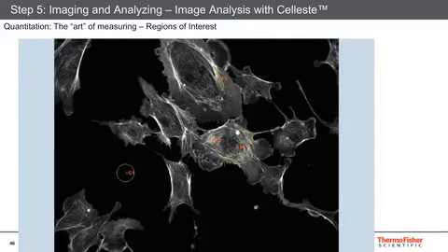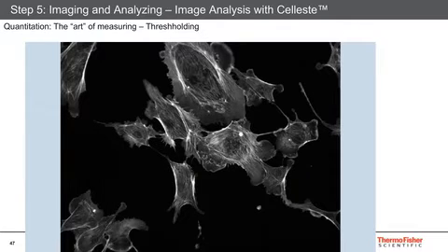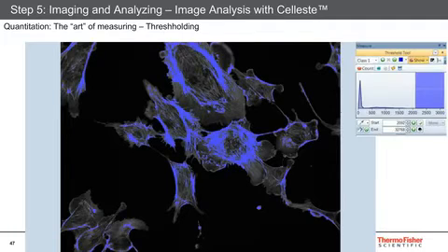And so instead I might use a different way to measure using a thresholding technique. Thresholding is where you take your image and you adjust so that you measure over or under a certain intensity. So here I'm thresholding in blue those areas that are colored, and I'm adjusting the thresholding.